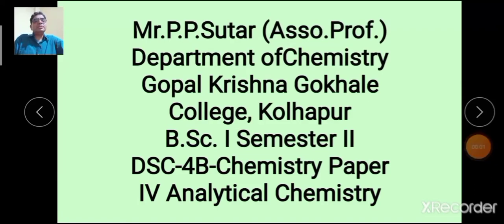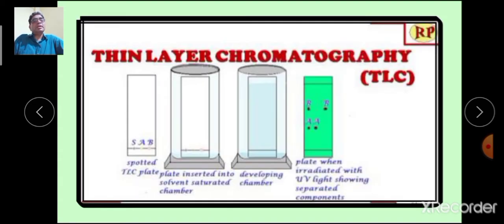Welcome students. In this lecture, we are dealing with the topic chromatography, and from this topic, thin layer chromatography, shortly called TLC.